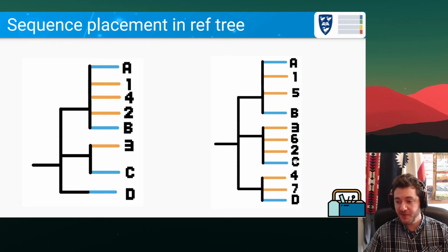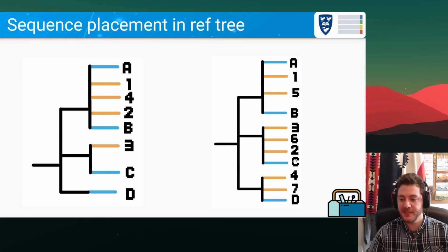And if you've ever messed around with phylogenetic trees where you've got maybe 10 sequences, you make a tree, you see what it looks like, and then maybe you add in another sequence and you see what that looks like, you will notice that the clading will change dramatically.